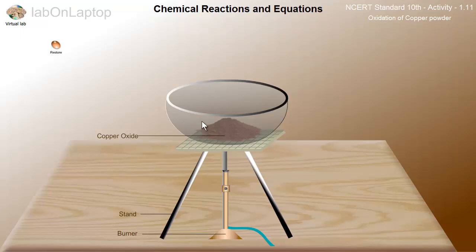Remember that color. I am clicking the Restore button. When you click the Restore button, you will know how many color changed. If you want to repeat this whole experiment, you can also click the Restore button. Look, I am clicking the Restore button. This was our original color.